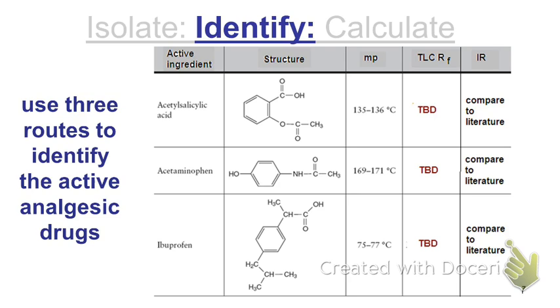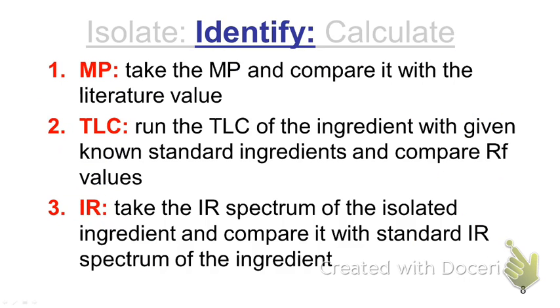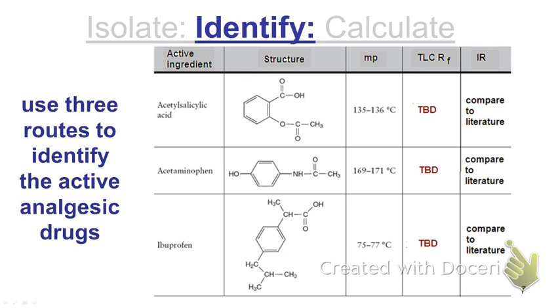So we now have our solid crystals, so we need to identify our compound. How can we identify the compound? We could obtain a melting point. So we've got 3 possible analgesics that you can work with. Okay? So we can just run a melting point. We got 3 very, very different temperatures. Okay? So that's nice. We've got access to those. We won't have any real confusion there in theory.